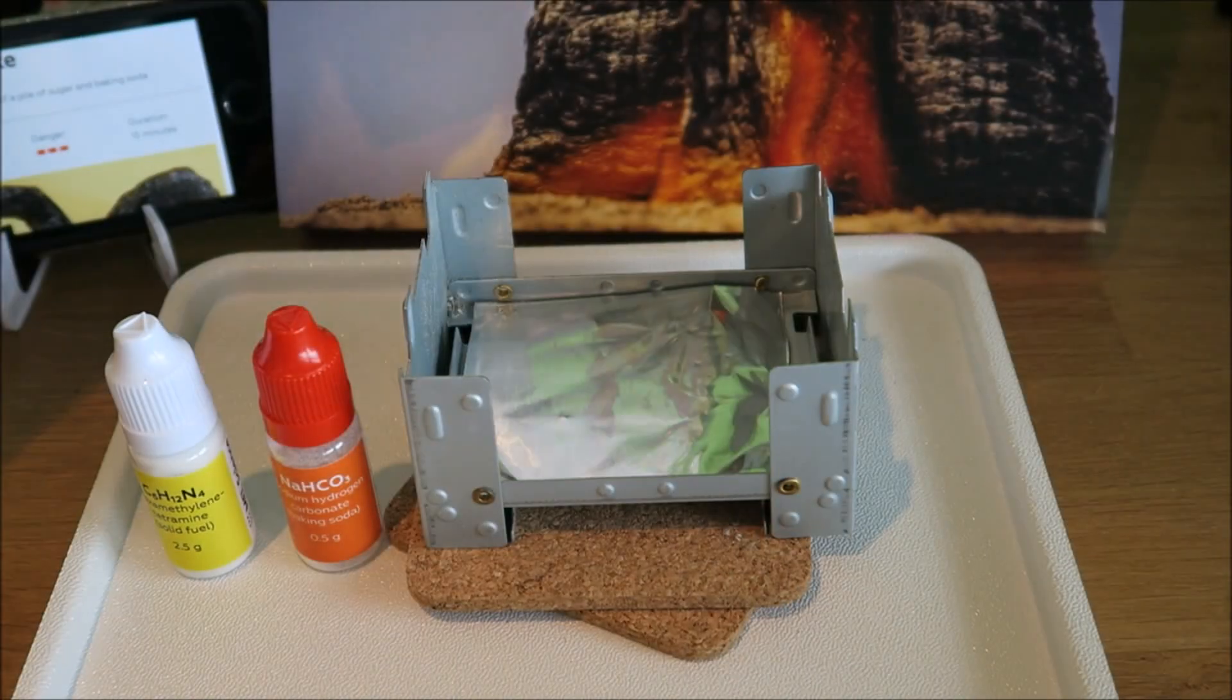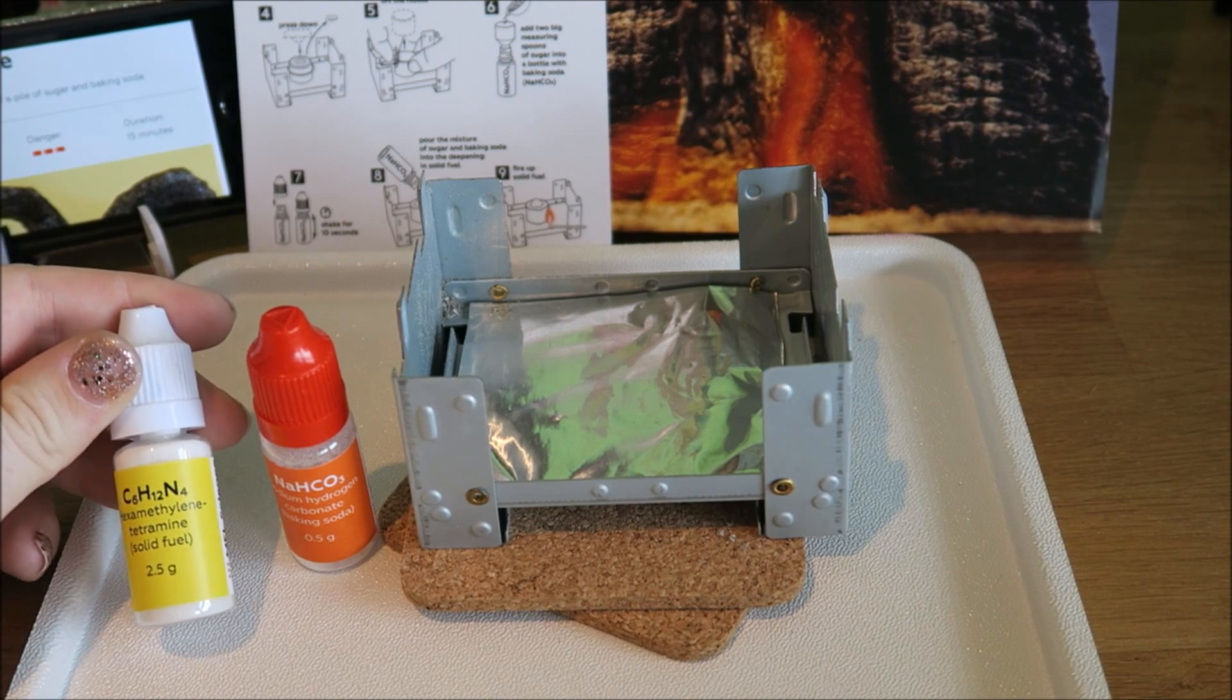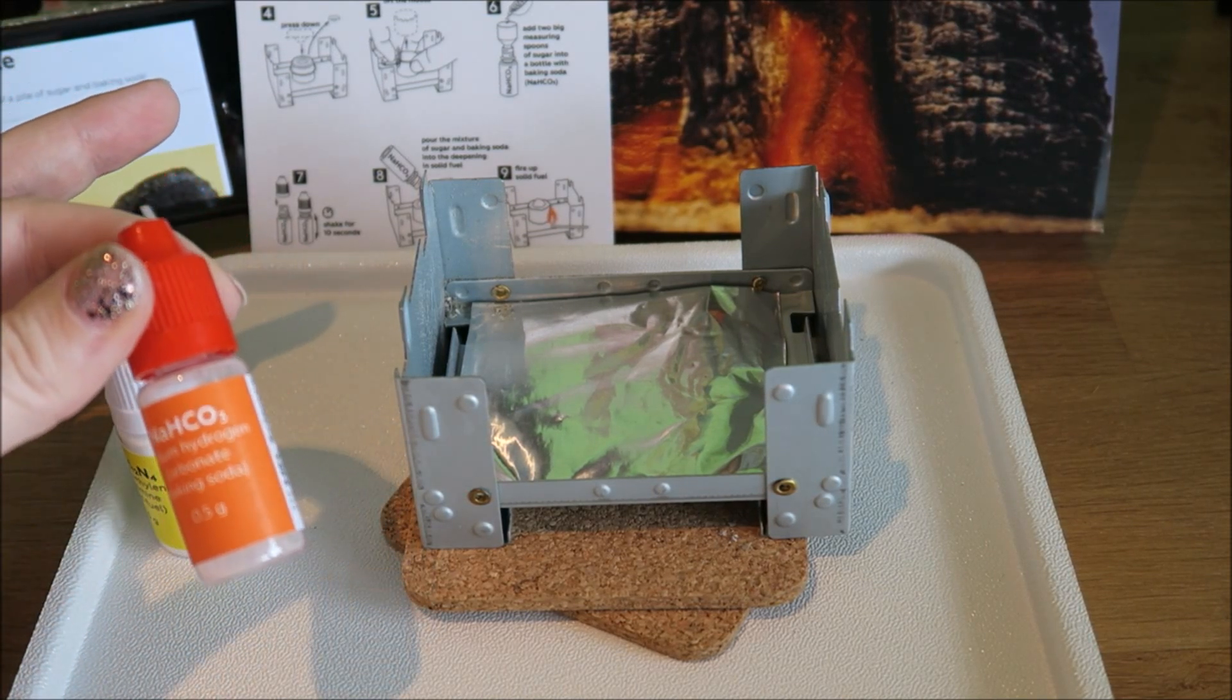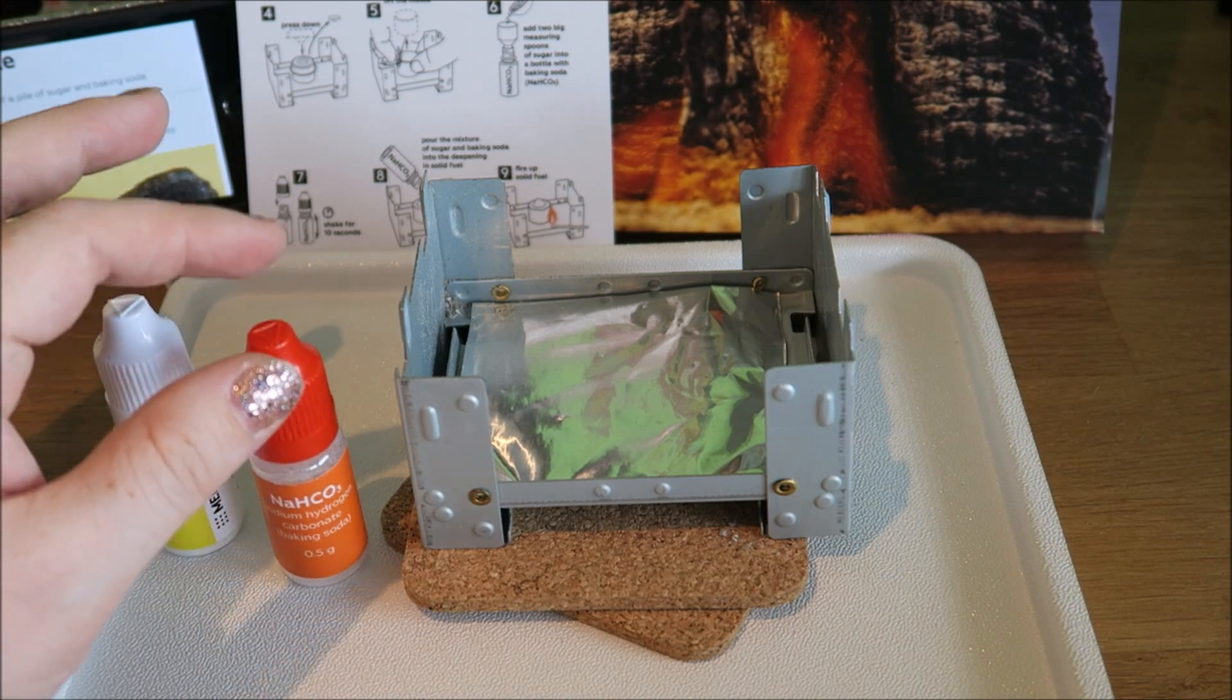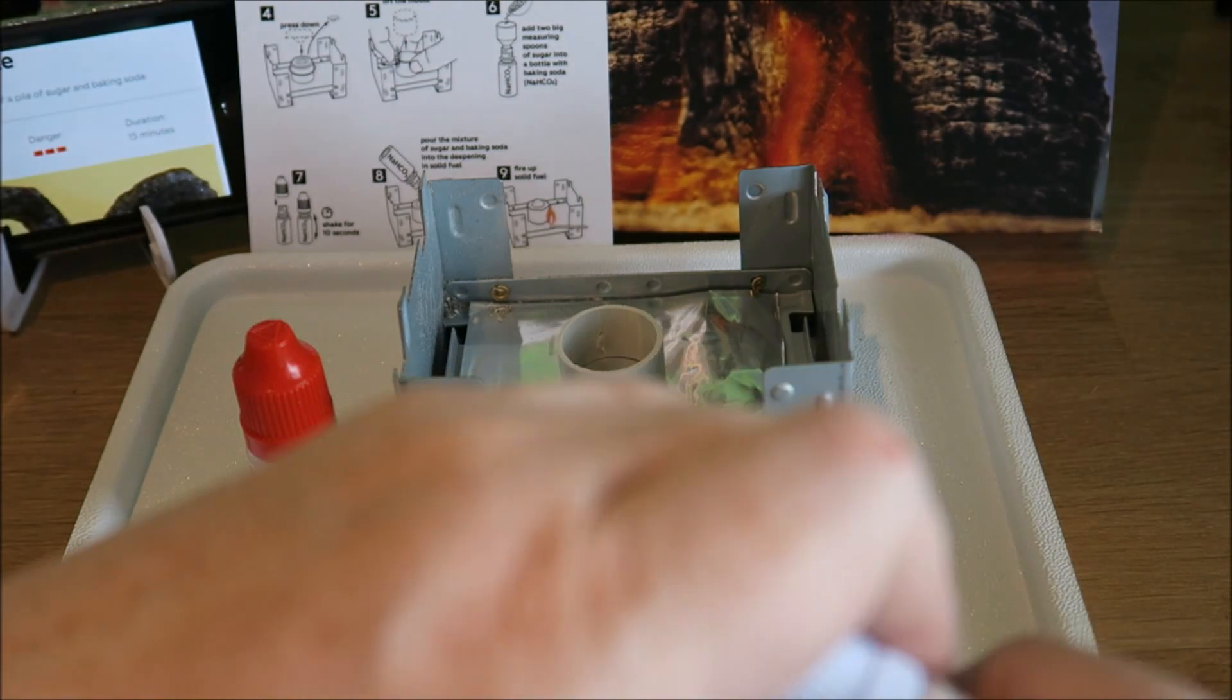For our sugar snake, we have hexamethylenetetramine which is our solid fuel, and we have sodium hydrogen carbonate which is baking soda. We need some sugar, have a little mold, put that on there, and the solid fuel all goes in there.